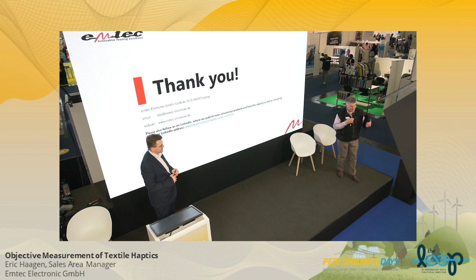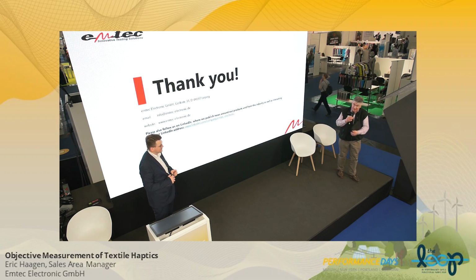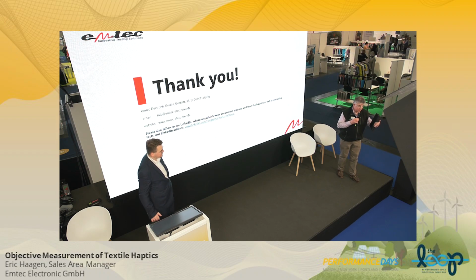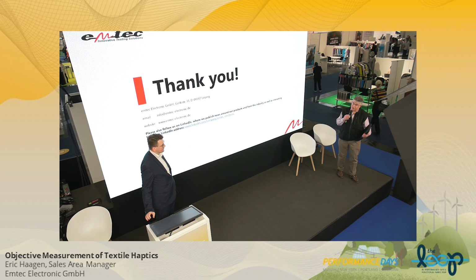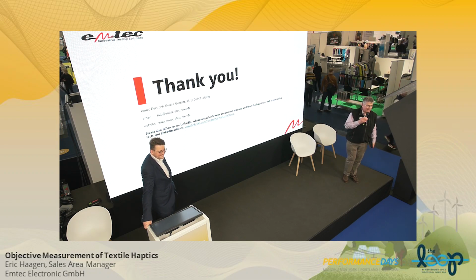We're now doing testing, which means that we know the average shed of the average fabric. Now, that has meant testing an awful lot of fabrics, so not only are we testing new fabrics from a good variety of the partners here, but also UV-aged fabrics, because that, of course, changes the haptic feel. So I agree with what you're saying, but I know for this industry, you have to meet them halfway. Isabella, thank you for the question.